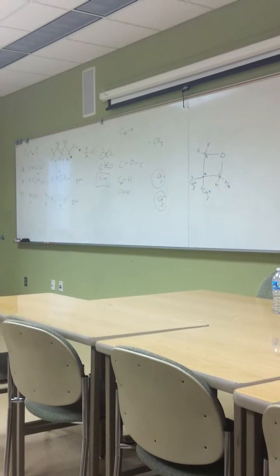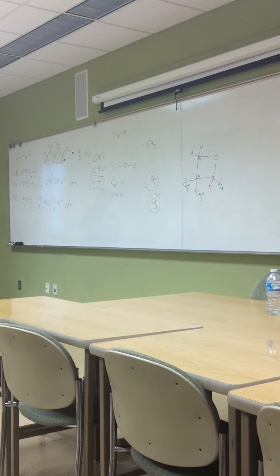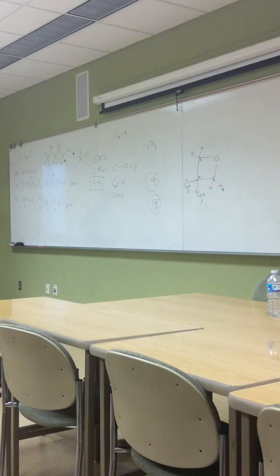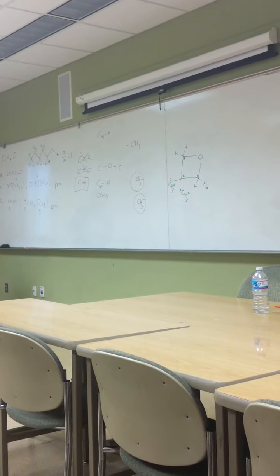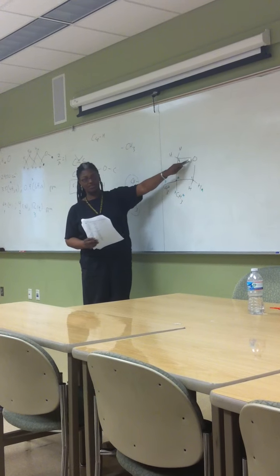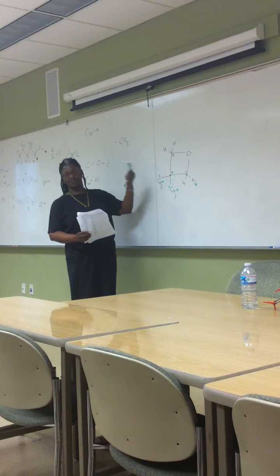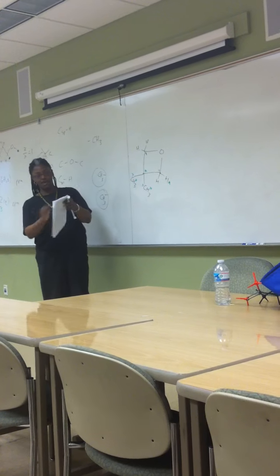And for these, 3.5 is in the range for alkyl hydrogens, but when you have a carbon and 2 hydrogens, that's on your table, right underneath the one where you have the methyl group. 1.3 is what you would expect, but this carbon is attached to an oxygen, so you'd expect it to be shifted further downfield.